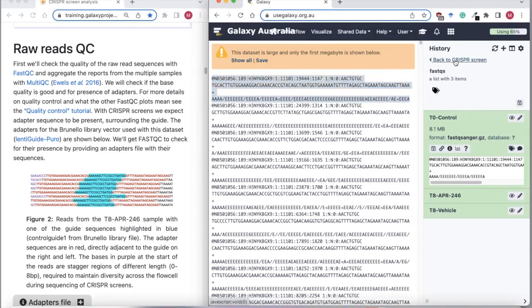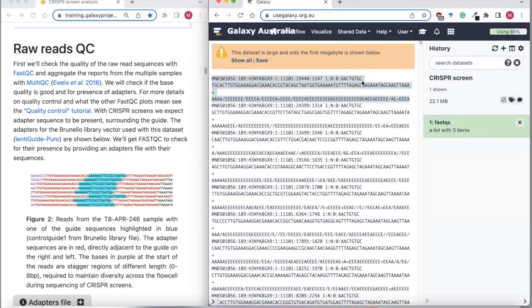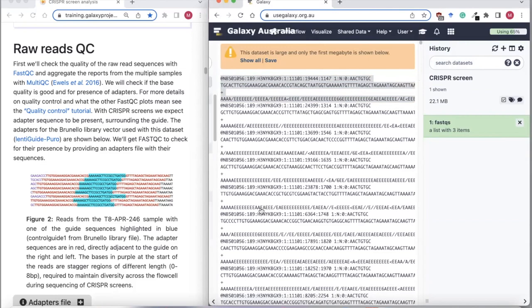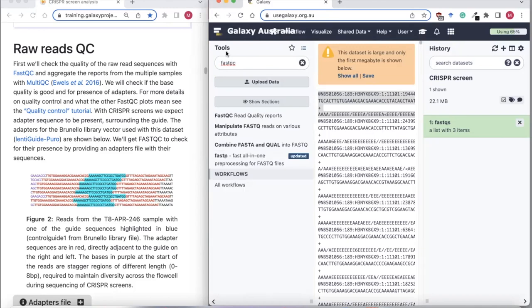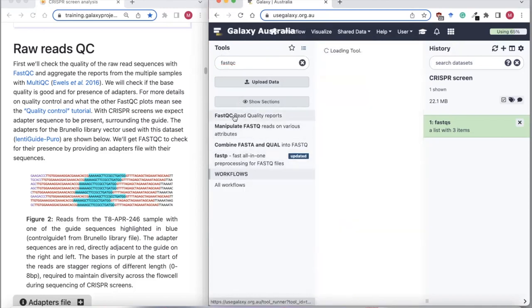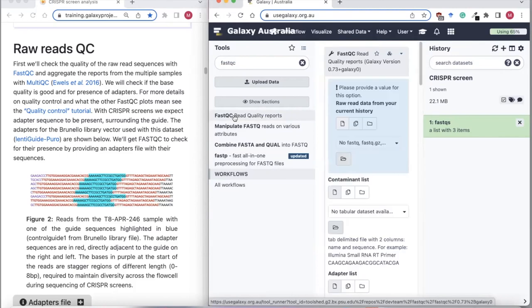Now we'll use a program called FastQC to have a look at the quality of these reads. I'm typing FastQC in the tool search bar and clicking on FastQC to open up that tool.